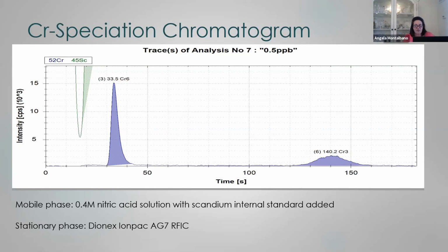And in addition, we just know, we're like psychic here, but we are trained on what is inherent to have concentrations of lead or any kinds of metal contamination. So once we decide that and train our folks to do that, then we send it to the lab. So Thomas actually gets that sample and analyzes it for us. And I hope that answers your question, Mary.